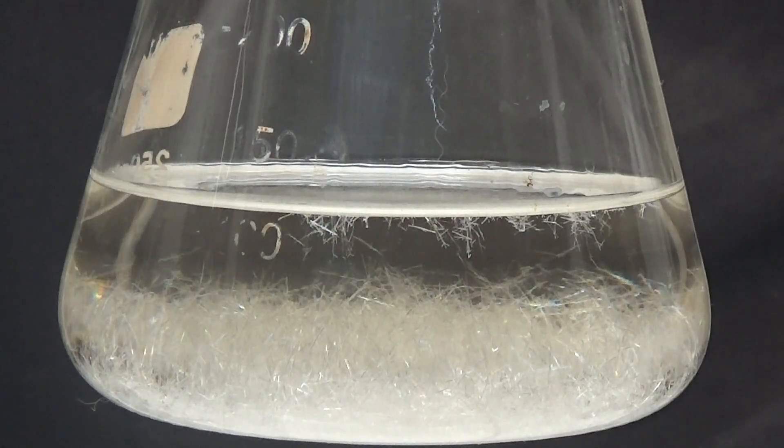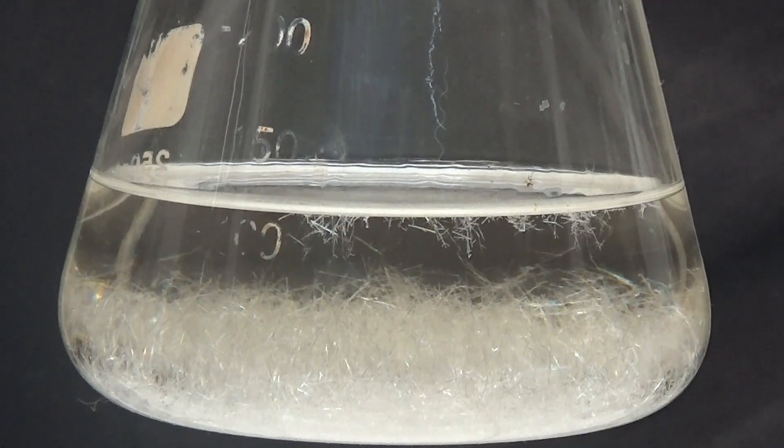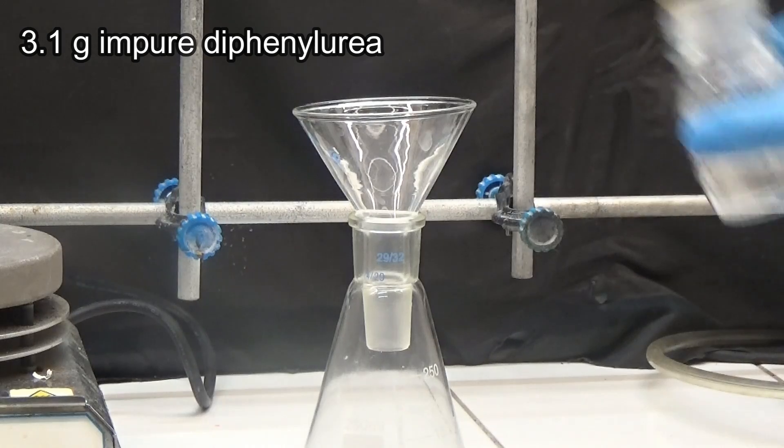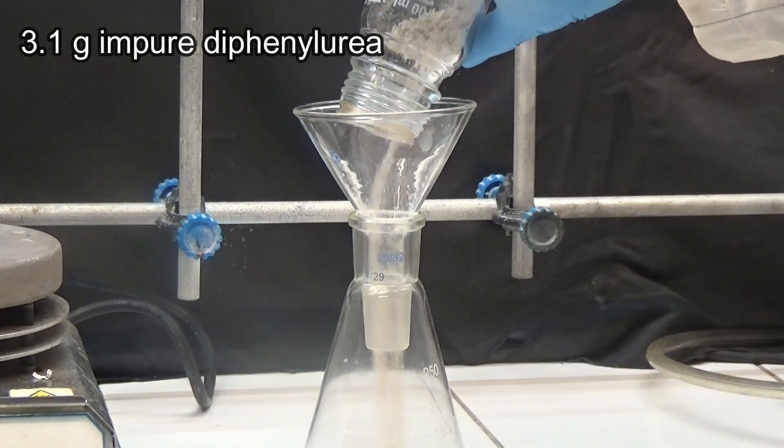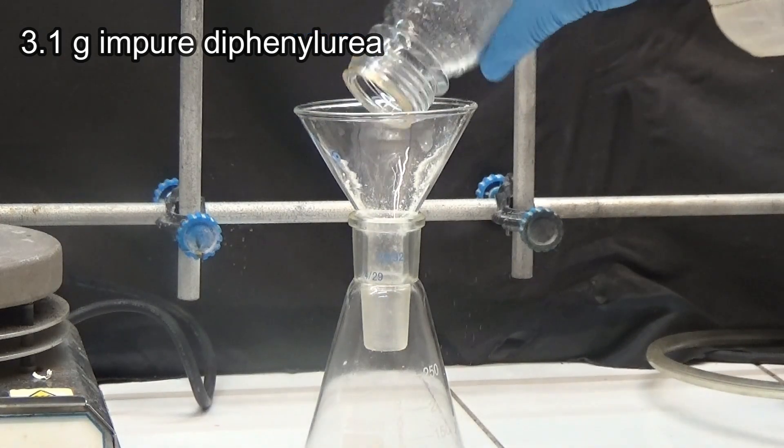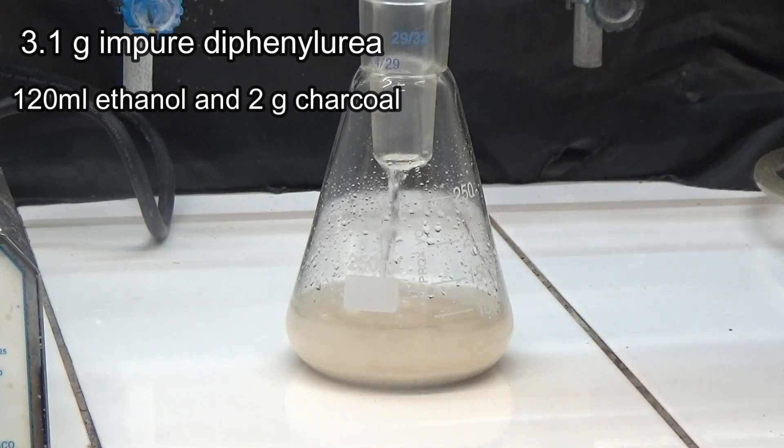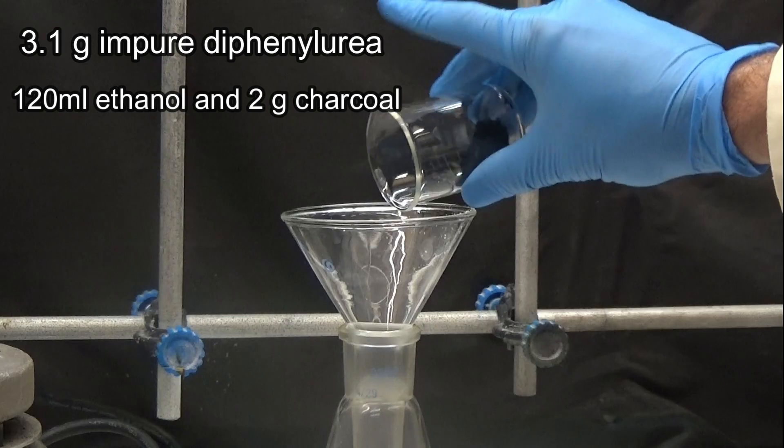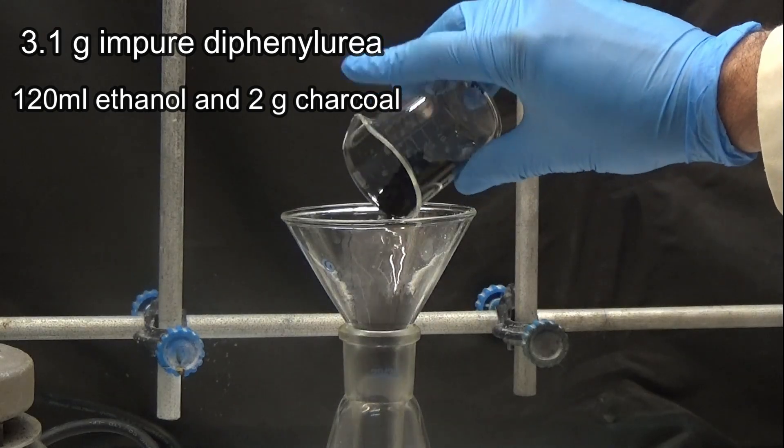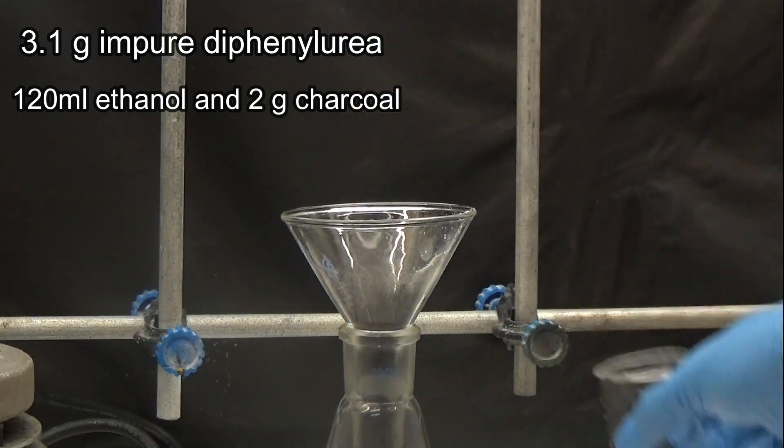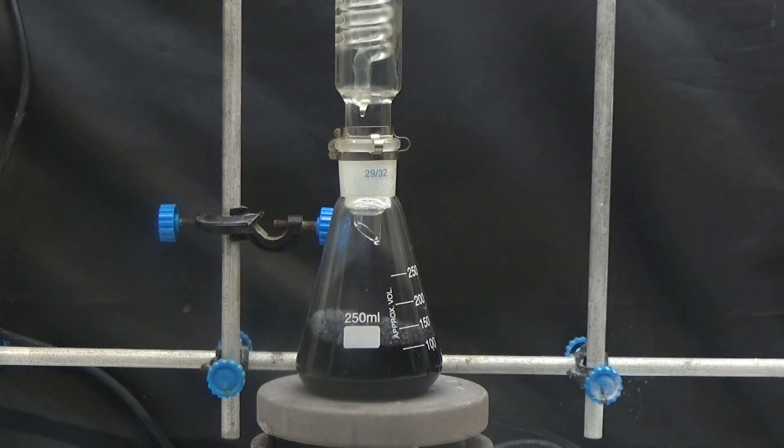Our next task is to purify the phenylureas that were obtained by crystallization. To purify diphenylurea, it is crystallized from ethanol and decolorized with activated charcoal. The impure diphenylurea yielded 3.1 grams. We dilute it with 120 mL of ethanol and add 2 grams of activated charcoal. Boil at reflux for an hour.